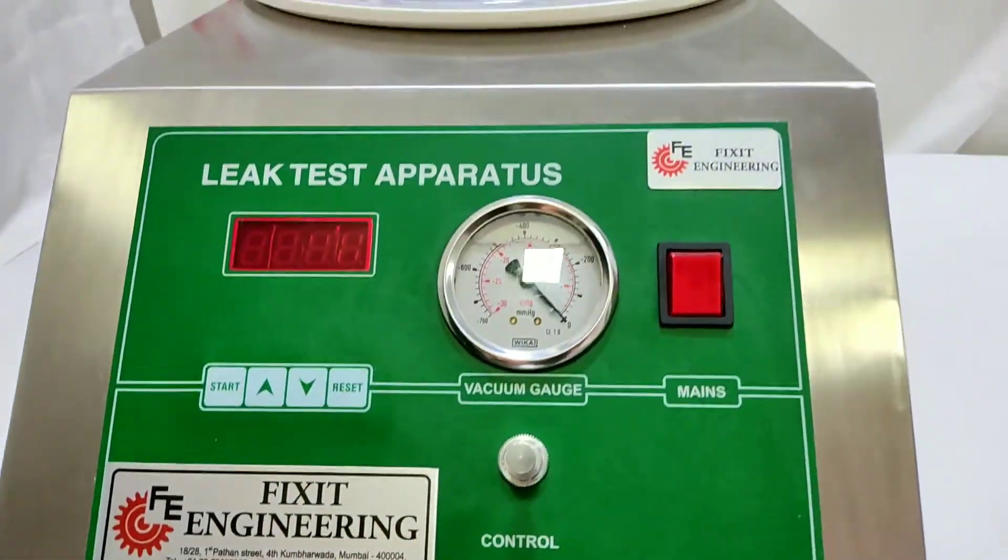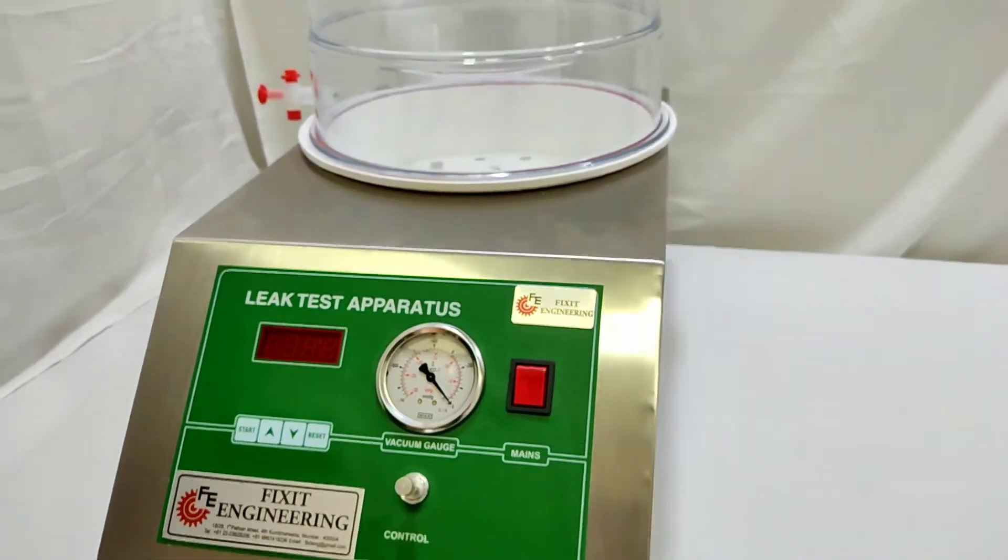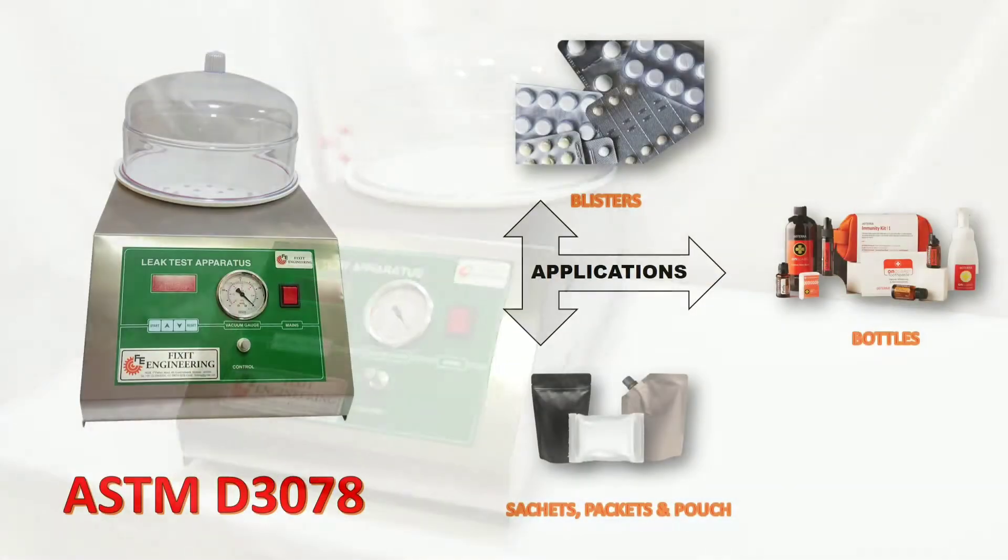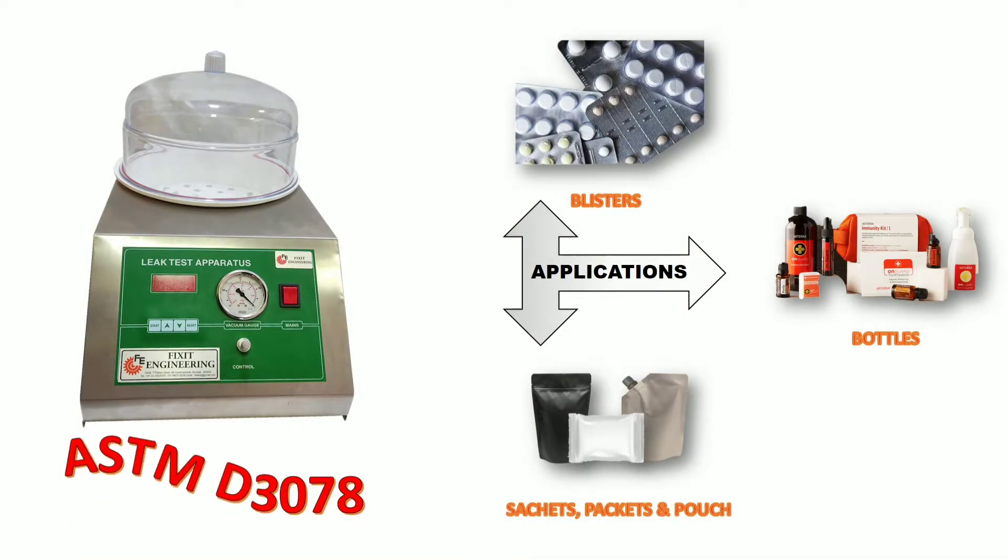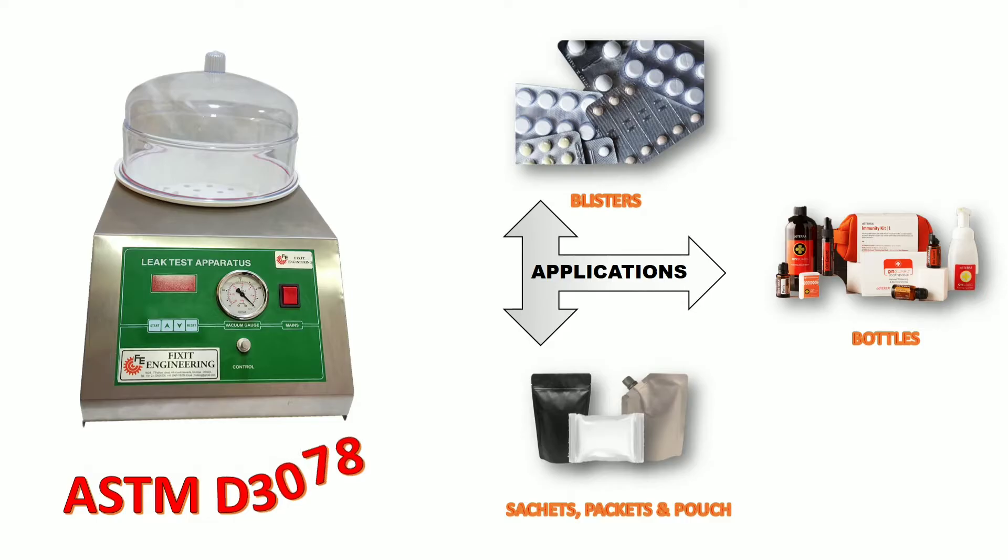Leak test apparatus is an ideal instrument to check sealing integrity of various products. The testing principles comply with ASTM D3078 standard.